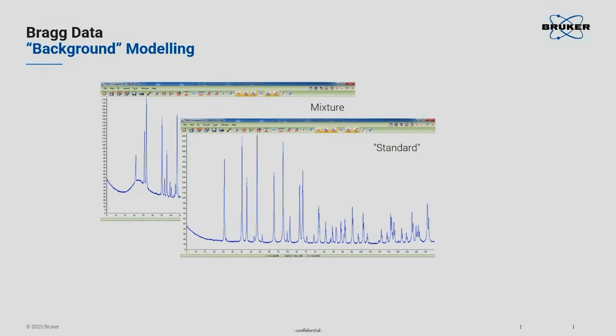Jim Klein, NIST SRM 676. This is a very nice work from 2011. I can provide you with a reference if you want. I think it's nice to know. It will not drastically change our analysis, but I think it's interesting to know.